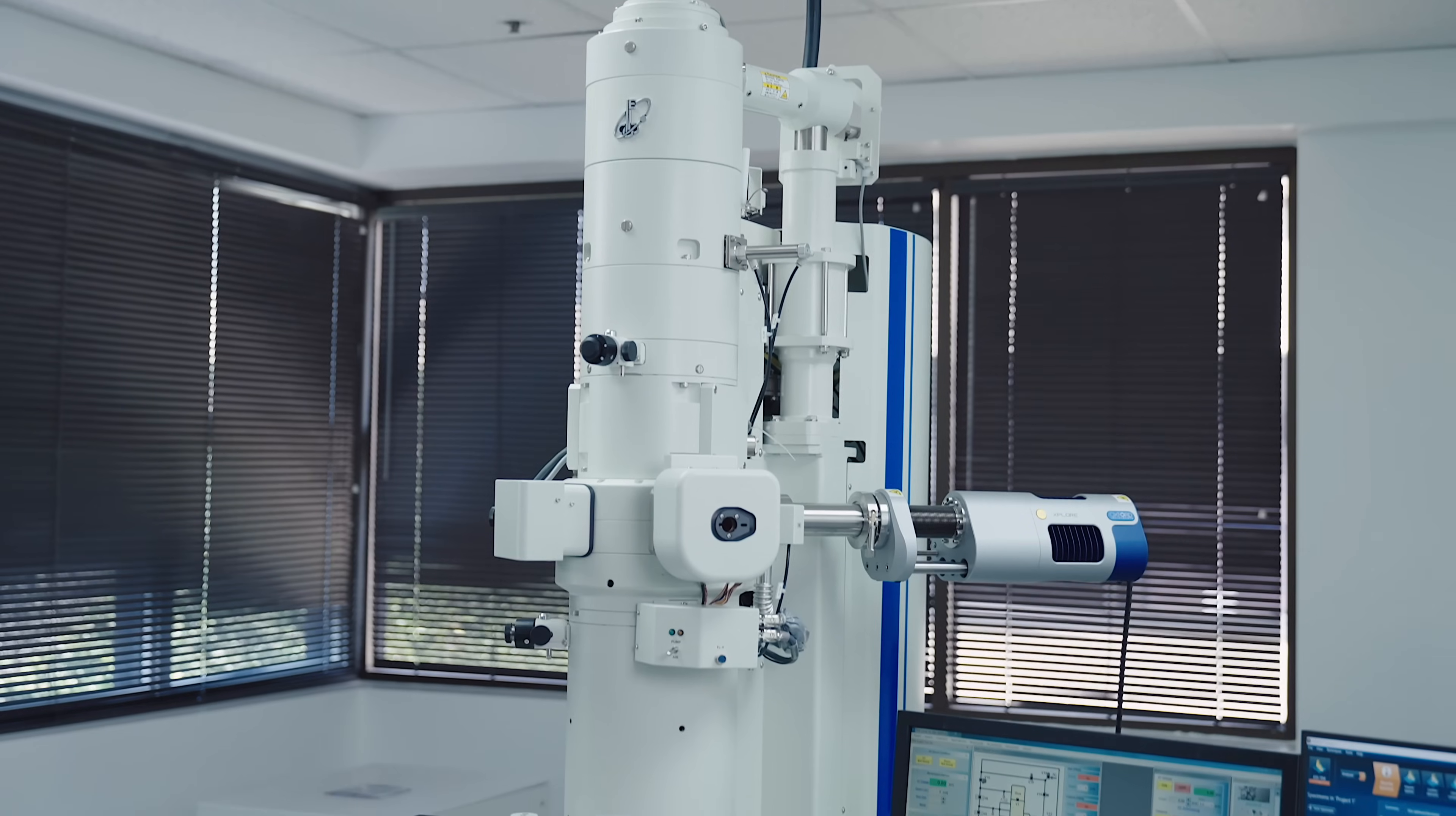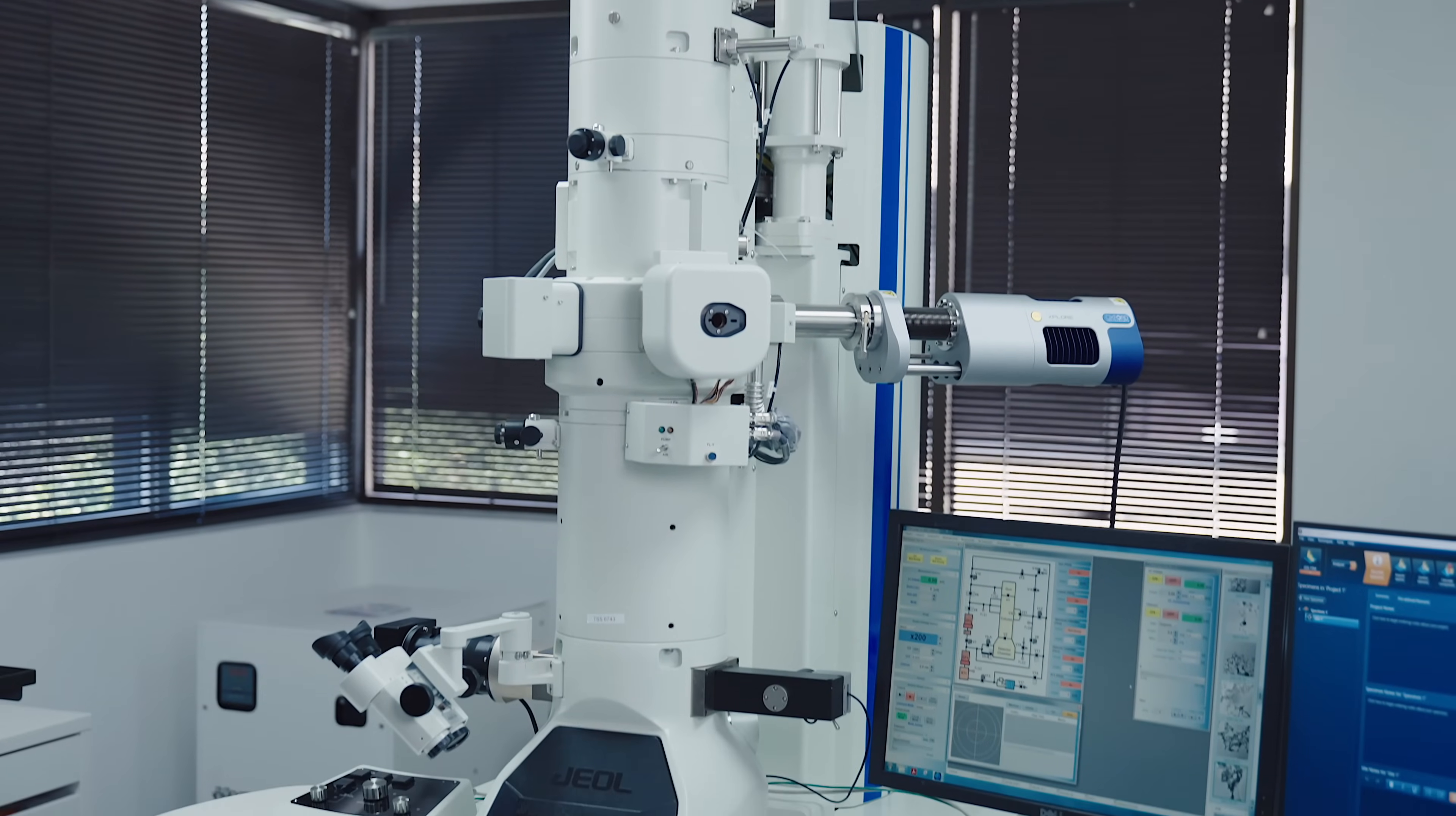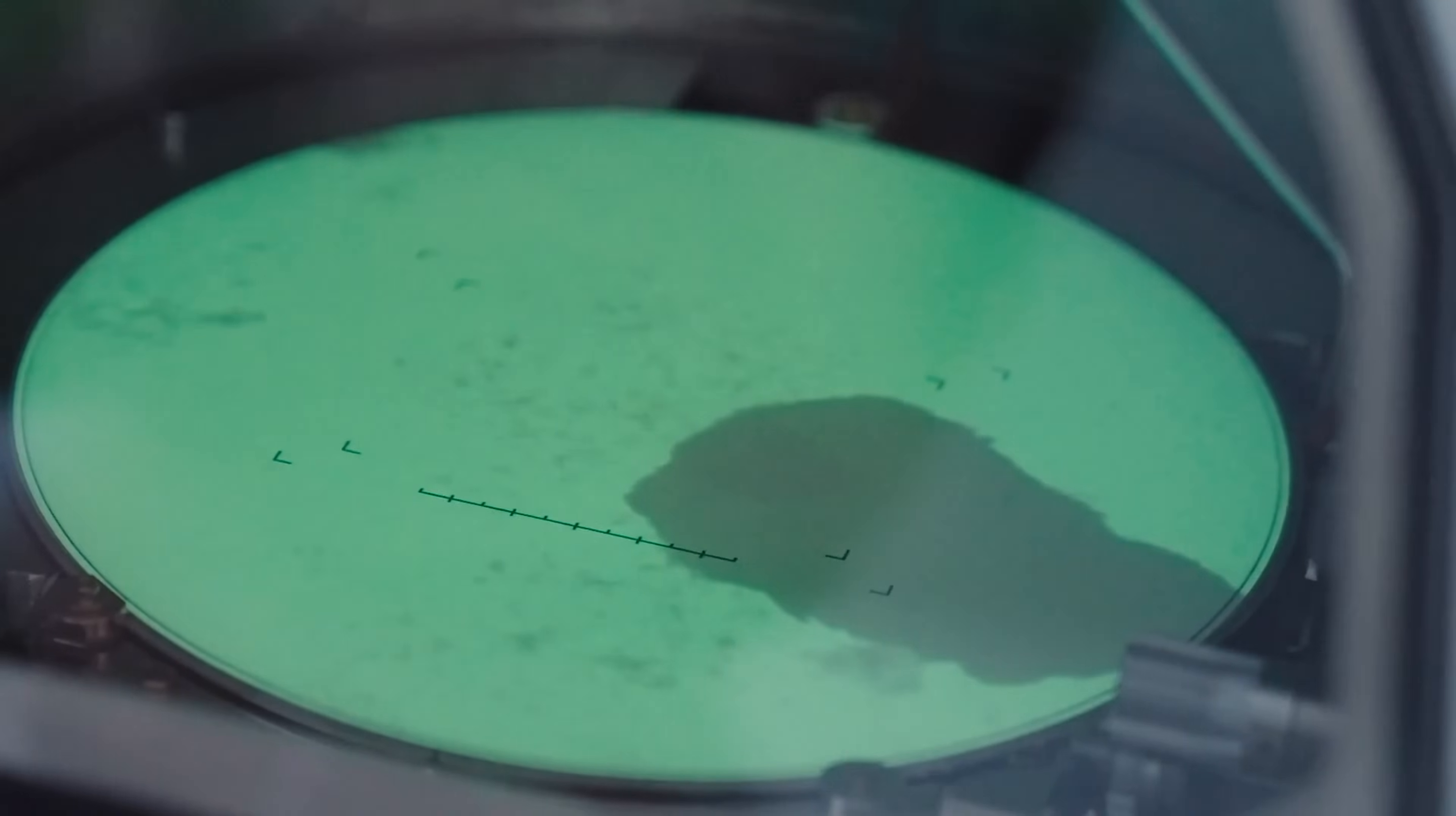My name is Matthew Fonda and we're here in the TEM lab. This is the TEM machine. It is a transmission electron microscope. What this does is it shines a very high powerful electron beam through a little sample and is able to show things at 25,000x magnification, even more.